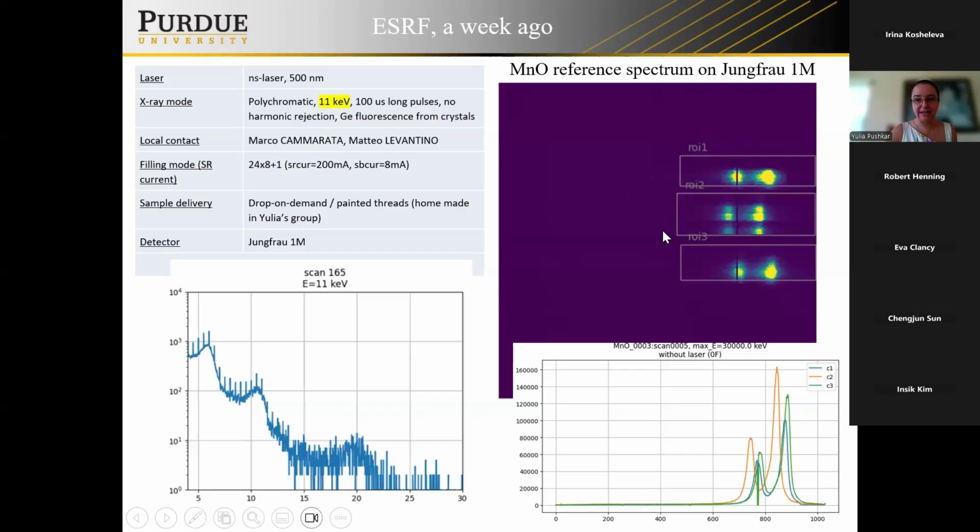What they say is that it takes a lot of computational power. So basically you run this detector with some kind of big server, which sorts those photons and understands those X-ray photons for you. When it is done, you have this distribution. So this is the concentrated sample. You see manganese somewhere around 5 to 6 keV. You have your scattering, we excited at 11, maybe some germanium fluorescence, since the spectrometer has germanium crystals. And then there are high harmonics that we were discussing how to clean. And this is the spectra, so nice and clean.